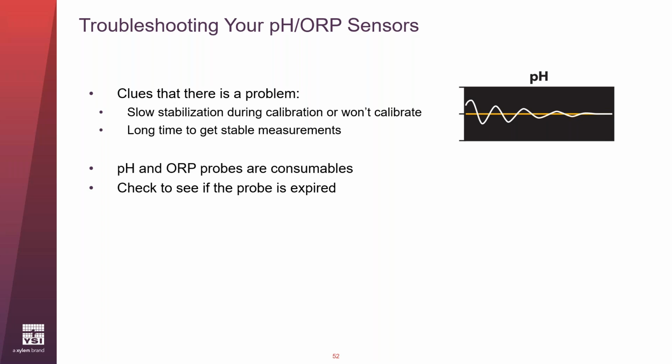As they age, small fissures on the surface of the silica layer on the bulb begin to form, which eventually will short out that U4 potential. As the probe gets older, the probe will usually tend to get smaller slopes. If it starts out at -59, it'll work its way down to -55 over the months until it has expired.